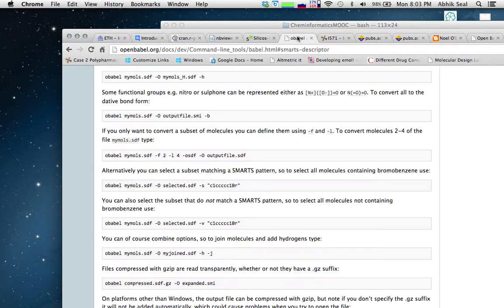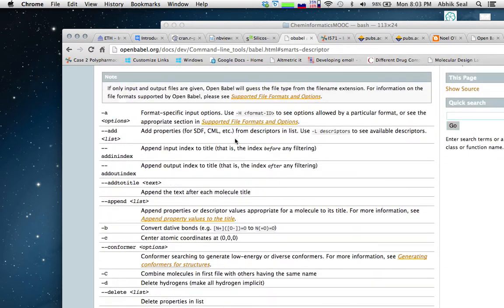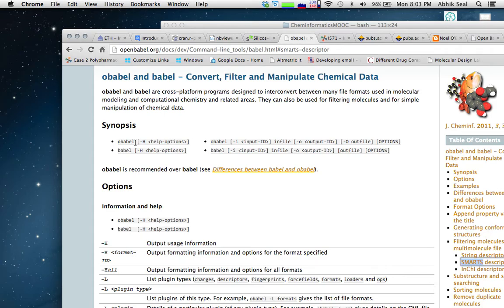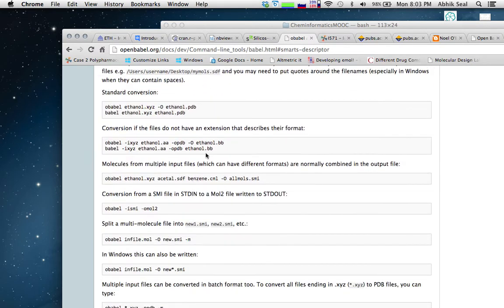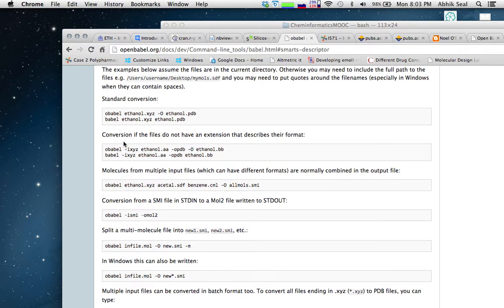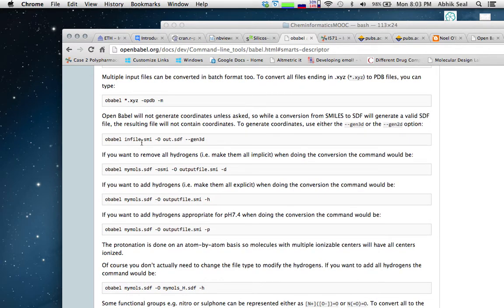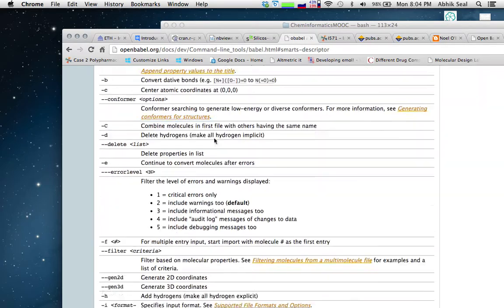The documentation page for Open Babel shows many command line functions. You type either 'obabel' or 'babel' — 'obabel' is the latest executable. For example, if you want to convert molecules from multiple input files in various formats, you type the filenames and specify the output format. If you want to generate 3D conformations of compounds, you provide the SMILES string and add the '--gen3d' flag. There's a full list of these functions available in command line format.